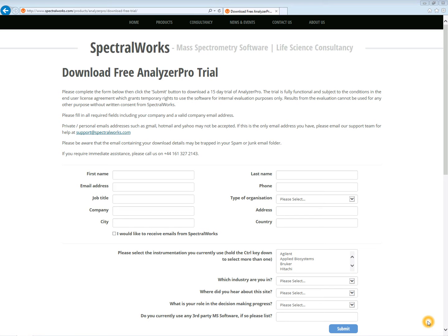Welcome to SpectralWorks tutorial on how to download and install Analyzer Pro. The first step is to go to our website and request a trial version of Analyzer Pro. Once this step is complete, we will email you a serial number and download link.